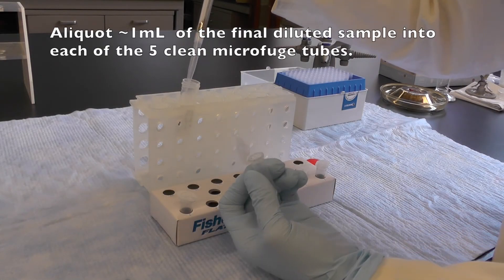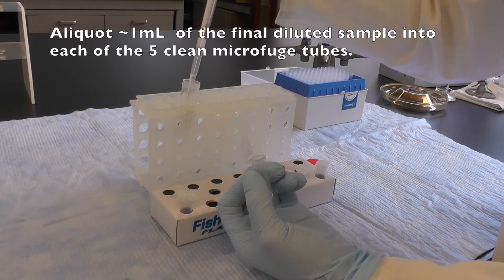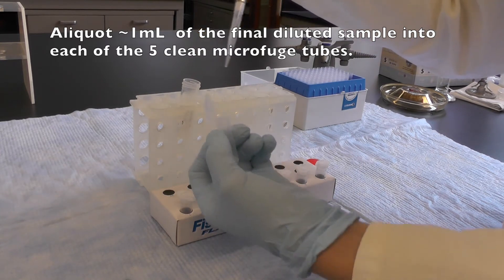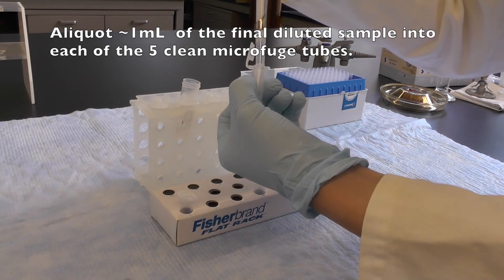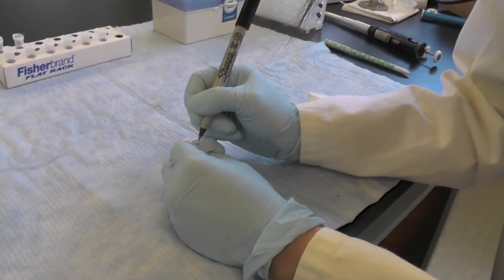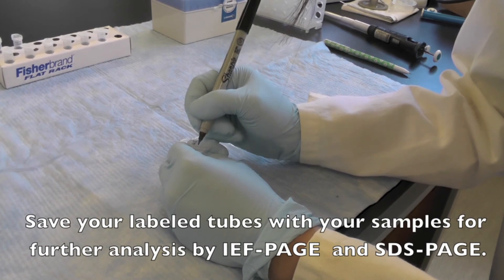Then, aliquot approximately 1 mL into 5 microfuge tubes. Label with your group number, fish species, and concentration. These will be used for both IEF and SDS page.